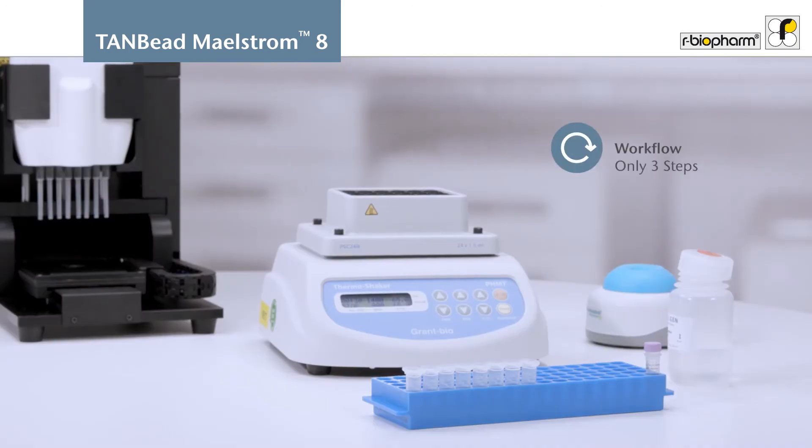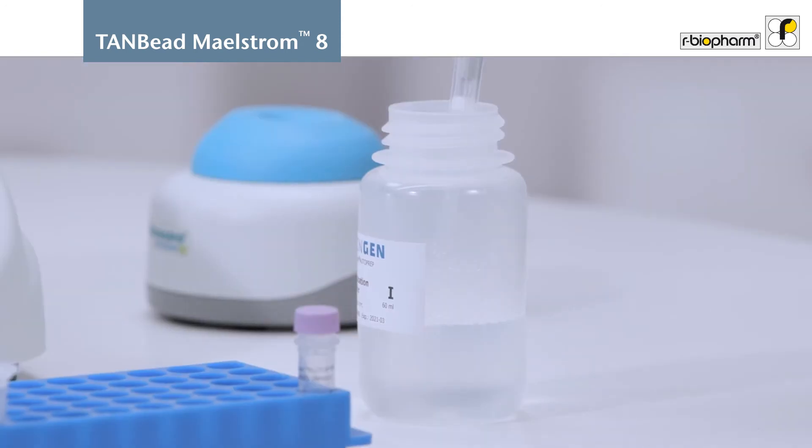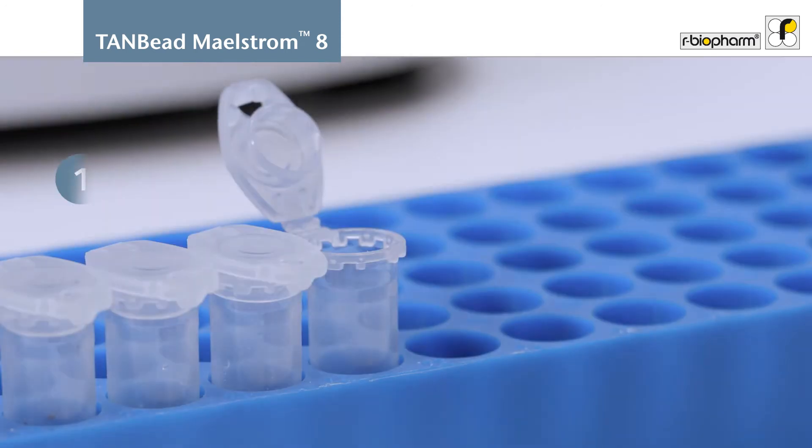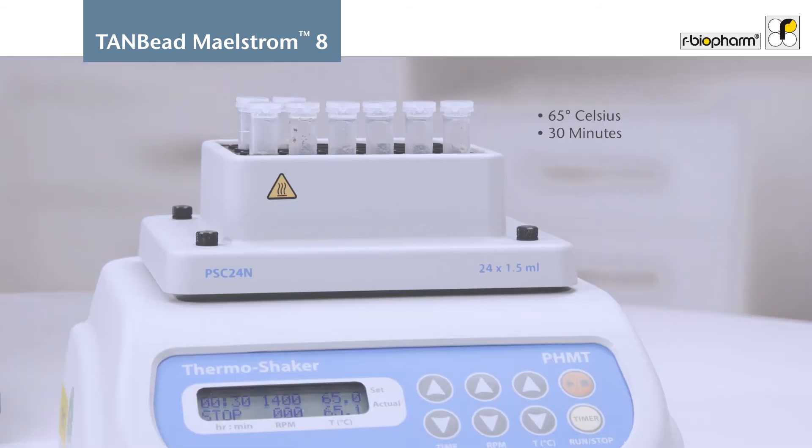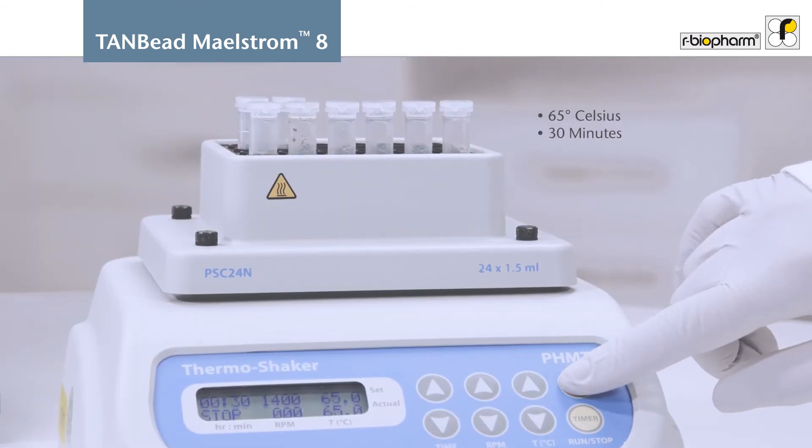The nucleic acid extraction process consists of three simple steps. A representative homogenized sample is mixed with the lysis reagents and incubated under continuous shaking on a thermomixer or heating block.